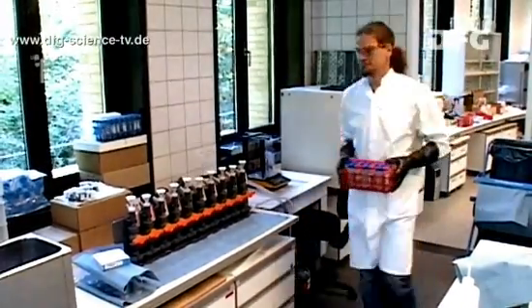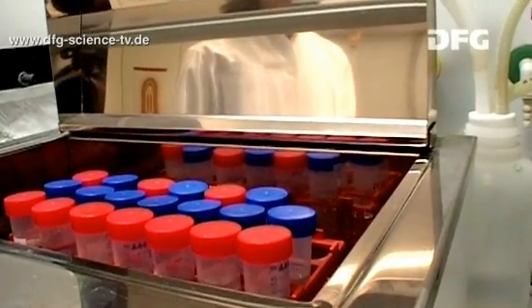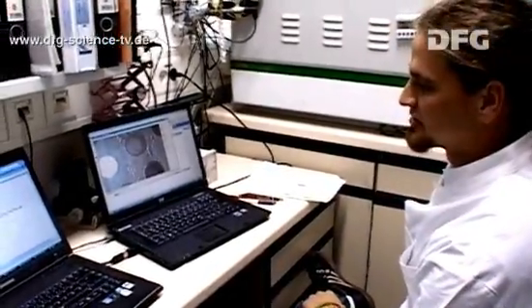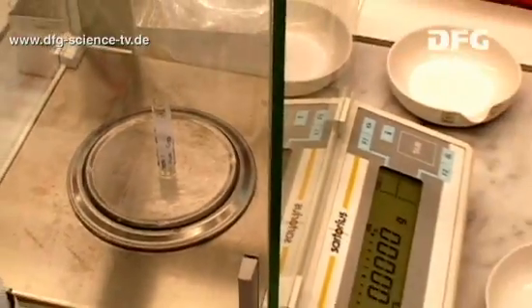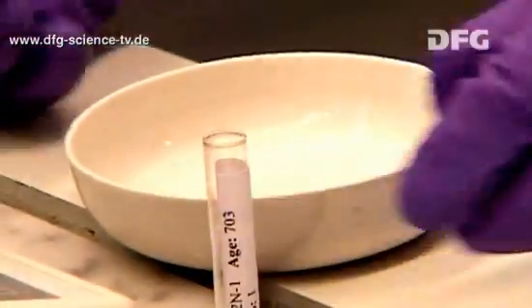The Isotope Laboratory in Potsdam is one of 8 institutes globally working on a method to tap into this structure and analyse the released oxygen, the preserved past climate, in mass spectrometers. For this purpose, the researchers need a diatom sample as pure as possible, aiming at a purity degree of 97% plus and higher.